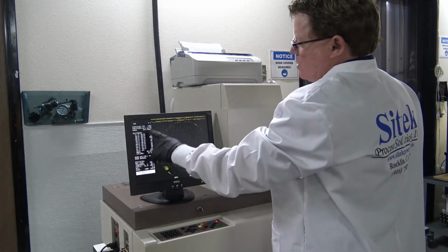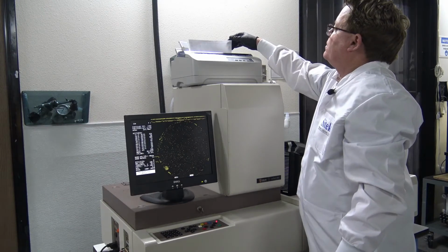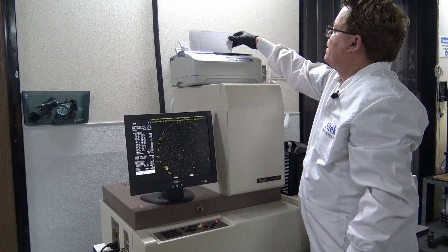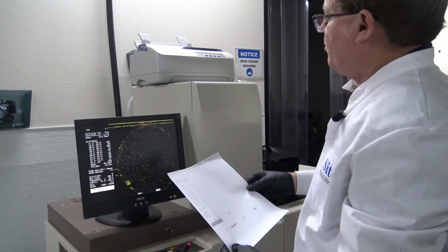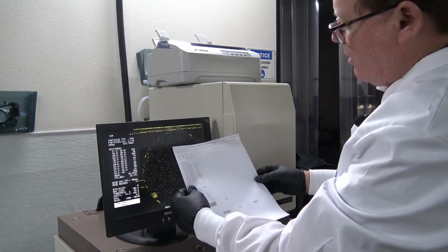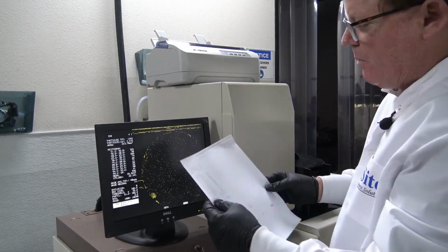Notice, because as our particles went up, now we're over max over haze again, and that's because we have too many particles with the haze. So what you get here is basically a print screen. Okay, hard to see because again there's no color. That's why we have a new print ribbon coming. But as you can see, it gives you the histogram of the size particles and where they're located, and the actual particle. Again, this will be printed in color, and the customer is having color ribbons sent directly by FedEx to them for delivery.